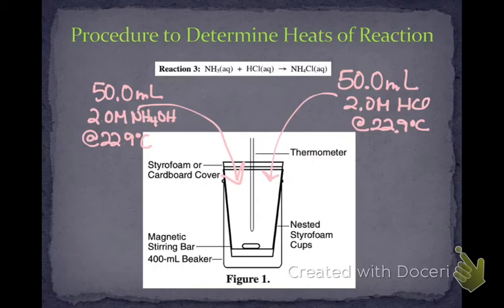And again, you'll notice that you have a thermometer going through the styrofoam cover of your calorimeter, and you'll be recording those temperatures.